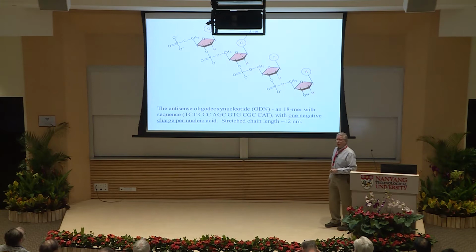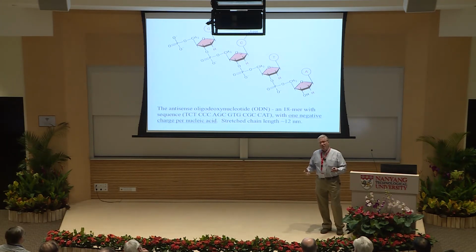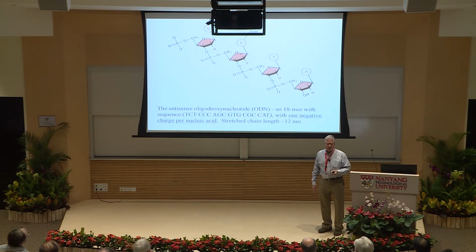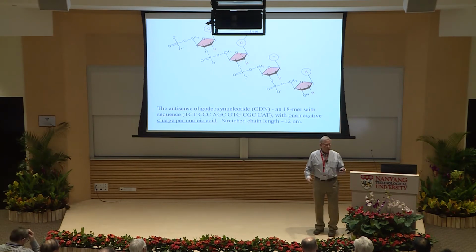So let's go back in history a little bit, about 15 years ago. This was work done on oligonucleotides complexed with a quaternary ammonium surfactant, or quaternary ammonium lipid-like structure. The idea was to form a complex that can be used for transfection, that means to introduce genetic material into the nucleus of the cell, part of genetic medicine.